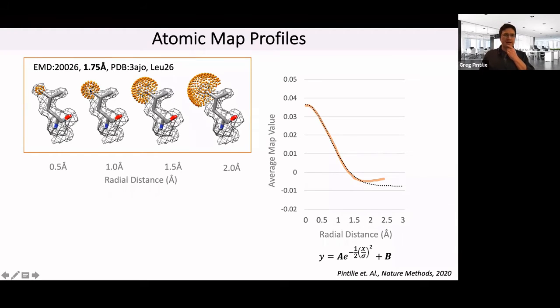Another thing you'll notice is that these points are such that they're closer to this atom than to any other atom. So as you go further away, the points on the sphere with that radius are only taken if they're closer to the atom that we're interested in than to the other atoms around it. This is a way to try to isolate out each atom's effect.